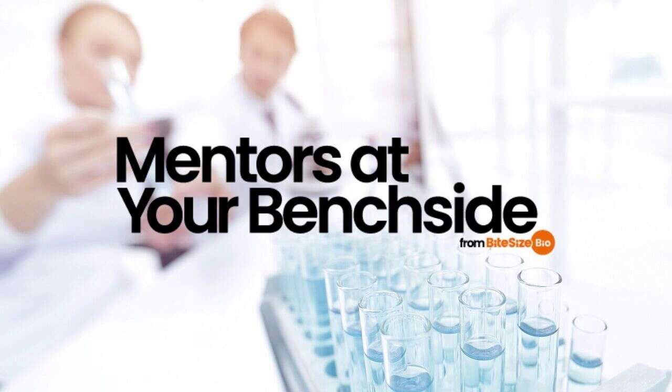The NCBI tool, Primer Blast, is widely used for qPCR primer design. There are many other primer design tools available online, including Primer 3, and PCR suppliers often offer their own design programs free of charge. So, getting started with qPCR primer design.